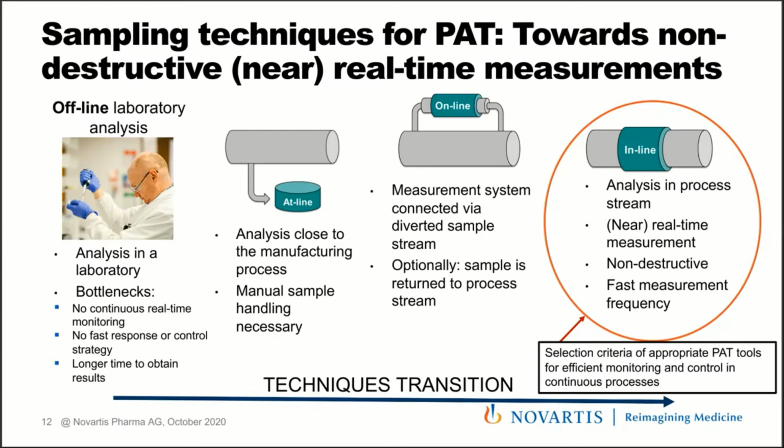On the other hand, there are the inline approaches, where everything is measured directly in the process stream. With that, if we have fast enough techniques, they give us results in real time, or fast enough that we can have some control and response time to do something in the process at the right time. At the same time, they can be non-destructive. It doesn't mean all of them are, because some of the technologies are not ready for that, but I'm sure, as I will show today, that these techniques will develop so that we can be completely sure and validated that this is non-destructive for the process stream. And of course, that's basically the only representative way to have a fast measurement frequency.